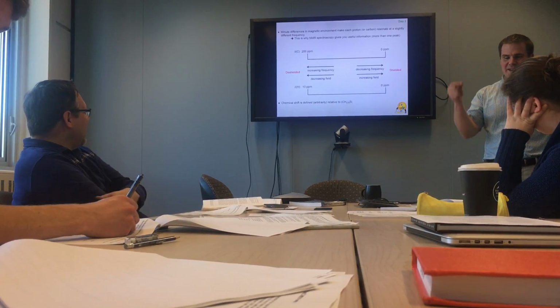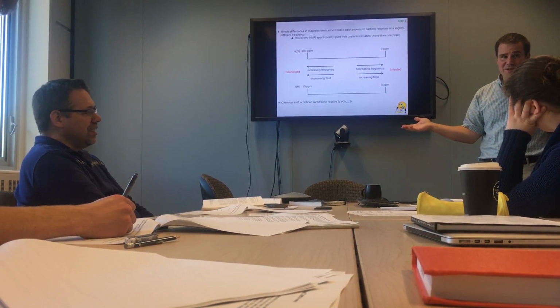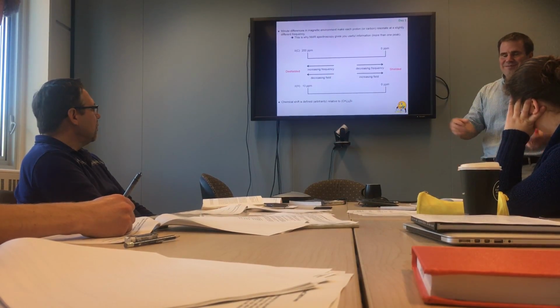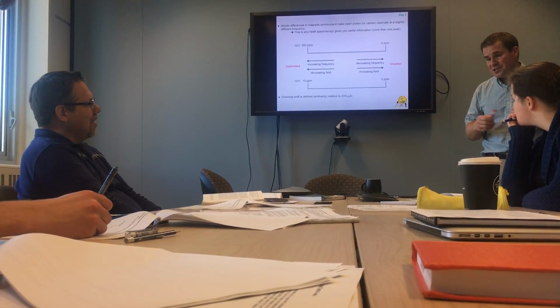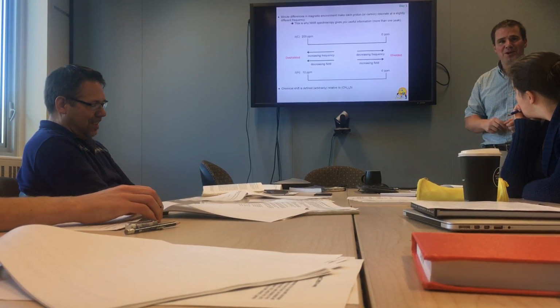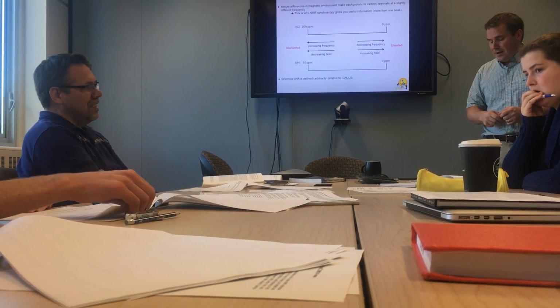So the reason for that is because tetramethylsilane is mostly out of the way of most of the peaks that we're looking at in the proton NMR, because it happens to come in at 0. Well, 0 is defined relative to it, but it happens to come to the right of most of the protons that we're looking at. And because tetramethylsilane doesn't react with stuff, so it doesn't react with other molecules that are in your mixture, mostly.